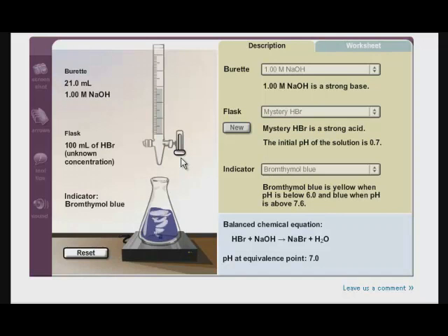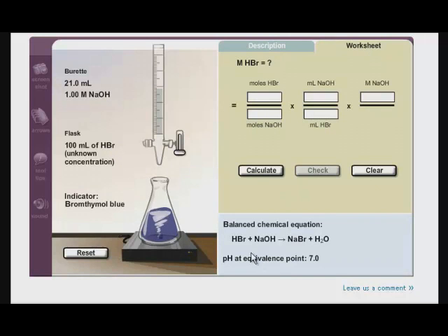So now what I'm going to want to do is I want to calculate the concentration of my HBr solution. I'm going to come over to my worksheet, and I'm going to notice right here that this is the balanced chemical equation. And I'm going to notice that one mole of HBr reacts with one mole of sodium hydroxide. So in my setup, I want to know, in my balanced chemical equation, I have one mole of HBr and I have one mole of sodium hydroxide.